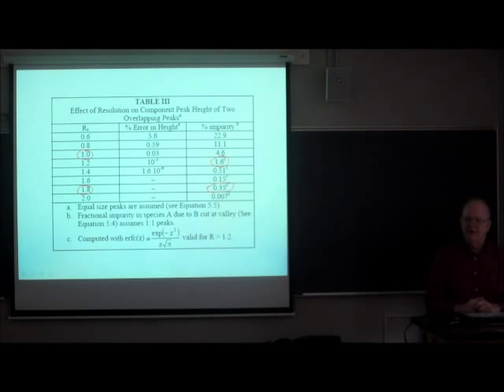Someone once asked me, is it better to integrate the peak by area or by height? And you can't integrate by height. It's a nonsense word. You can quantify by height and you can quantify by area. The area requires integration.